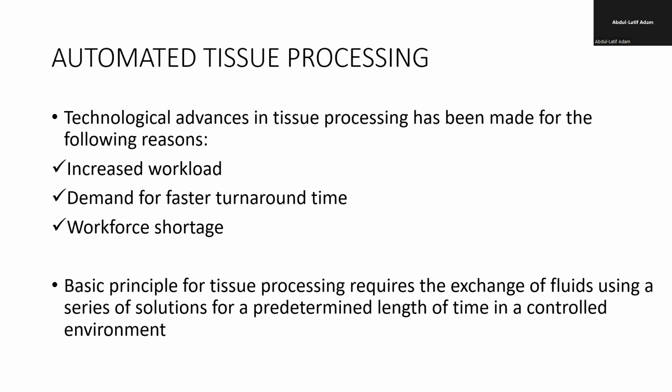Or you have the carousel method, where the fluid is at one place and the tissue moves round.